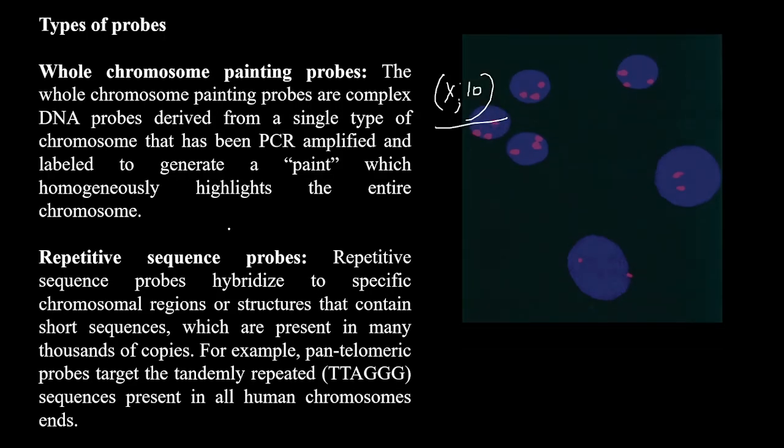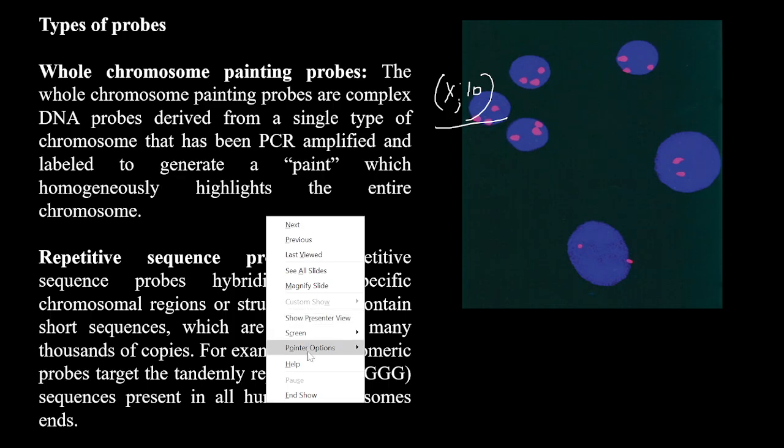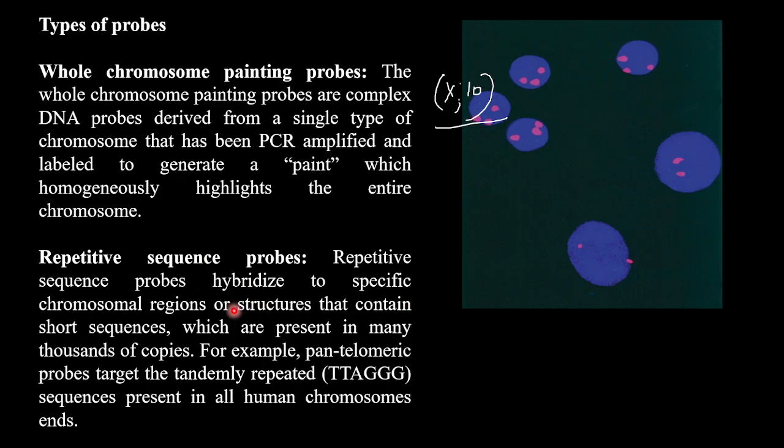Now coming to the repetitive sequences probe. The telomere has repetitive sequences, so if you want to study the telomeres, you can use the repetitive sequence probes. These probes basically bind to the repetitive sequences.